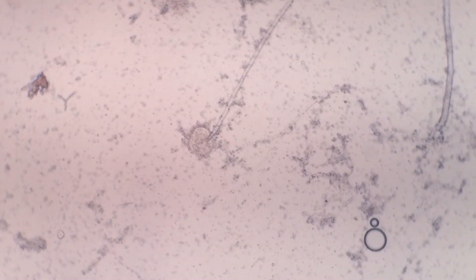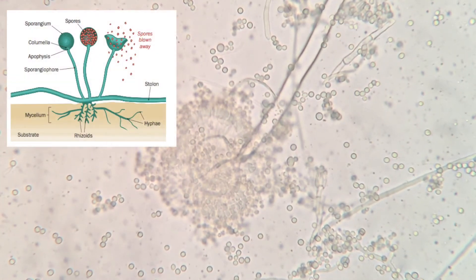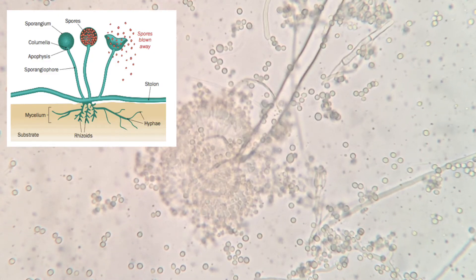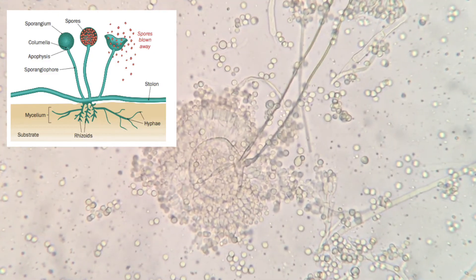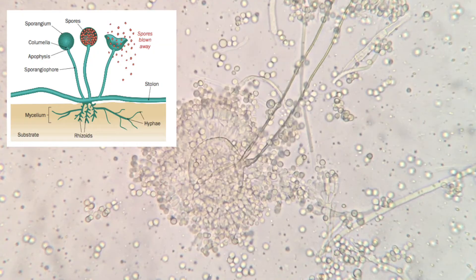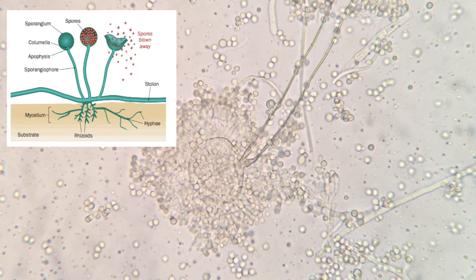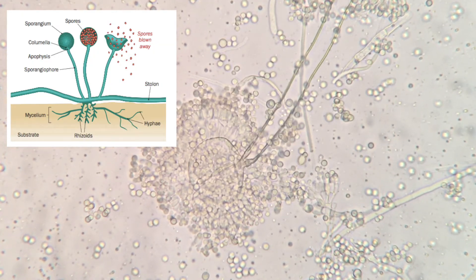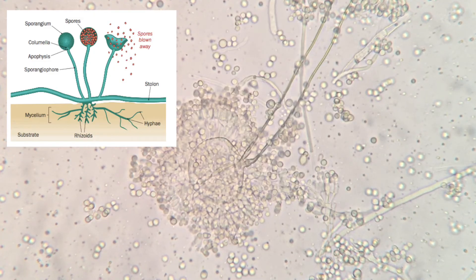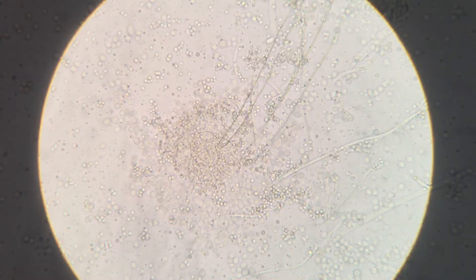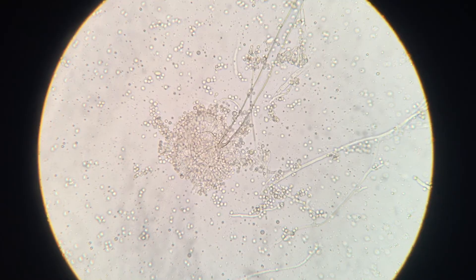Again we're starting to see a little bit more detail, but this high power view really shows us the spores, which are going to be the perfect circles all around there, and then this larger circle in the center is going to be the sporangium. I've put a little picture in the top left so you can get an idea of that. That is how the fungus reproduces — those spores will land on another piece of bread and make more mold.